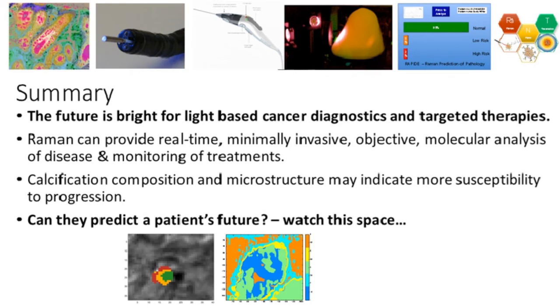There is a high potential of Raman being applied in the clinic in the future, but there is still a long way to go. There are a lot of hurdles, but the principle there is that there is a high potential of some of these delivering to being something particularly useful, particularly if there are applications where there are no better methods. But Raman's strengths really come in the fact that we're measuring the molecular changes of disease, and this enables us to potentially predict the future structural changes that will result in symptomatic change. So we expect to be able to make a diagnosis earlier than something that ends up with a structural change.